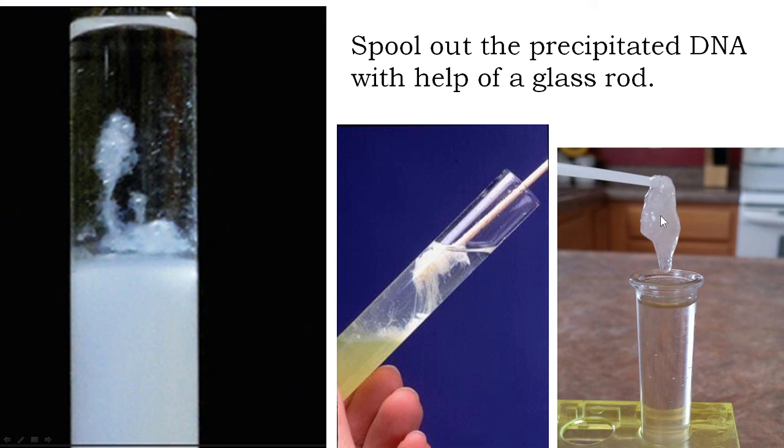This mucus-like thing is nothing but your DNA. It does not contain proteins or any other biomolecules — it is supposed to be pure DNA. This is the experimental procedure. I hope you are clear on how to extract DNA from plant materials. Thank you.